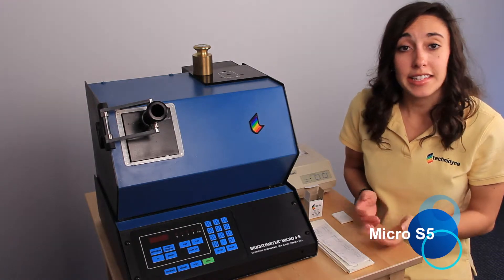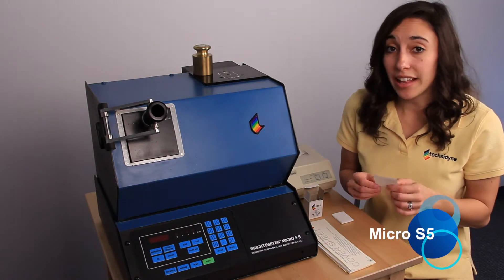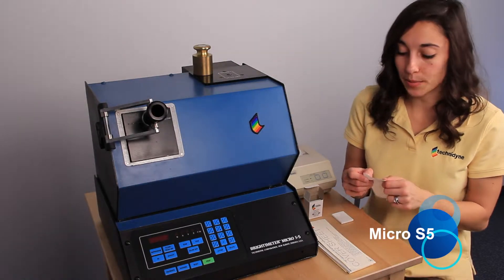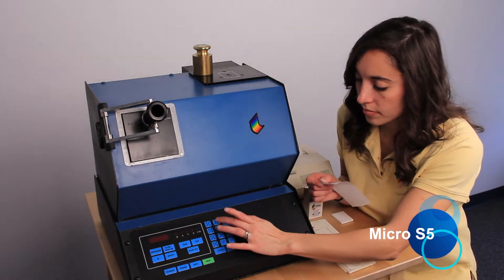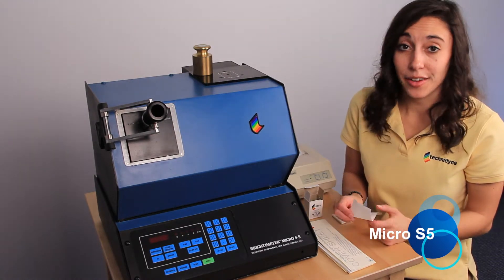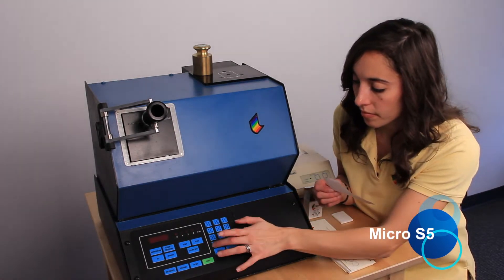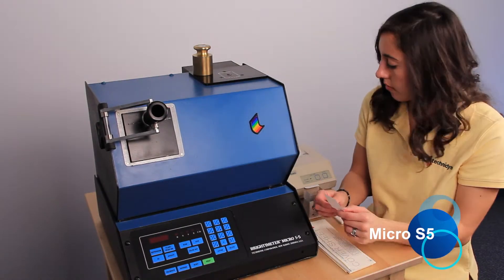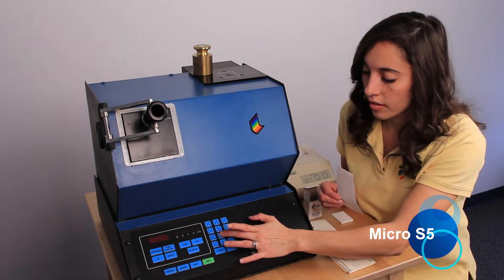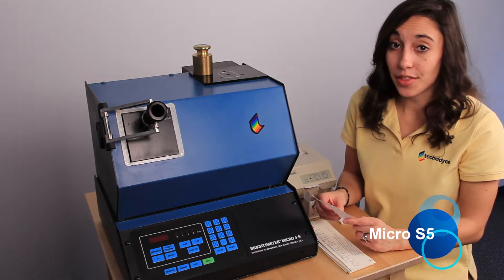The first thing it's going to ask us is to key in brightness. We'll take the printout from the 70 standard because that's our primary standard. Since we'll be calibrating to the first position, we'll take the value of the first brightness, which is 74.19, and we'll press enter. It's going to ask us the same thing for Rx, Ry, and Rz. Rx is 89.85, Ry is 87.10, and Rz is 73.63.